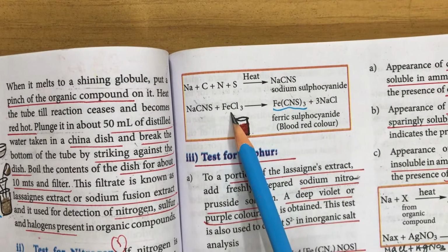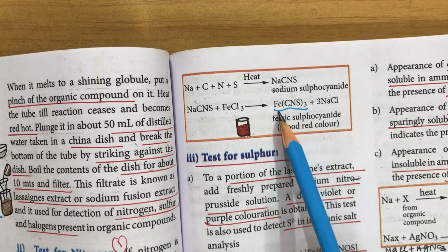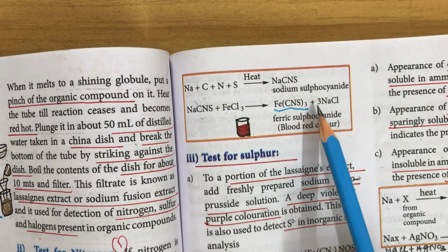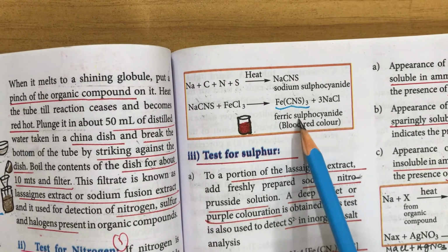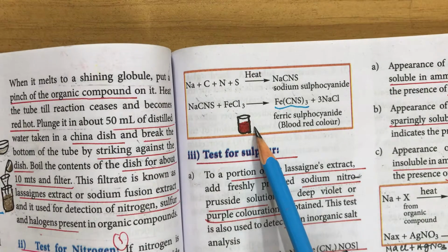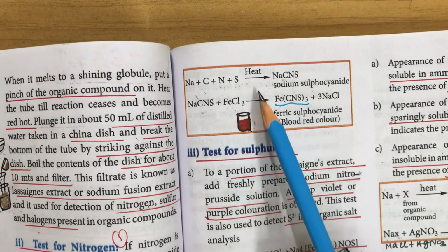If you add ferric chloride, the sodium sulfocyanide reacts with the ferric chloride and forms ferric sulfocyanide, Fe(CNS)3, plus sodium chloride. The formation of blood red colored ferric sulfocyanide shows the presence of nitrogen along with sulfur in an organic compound.